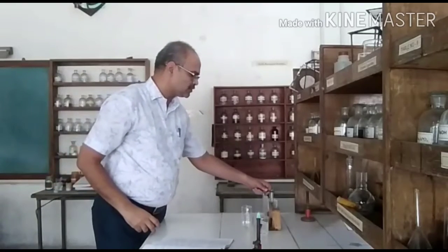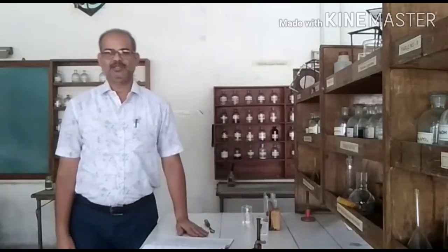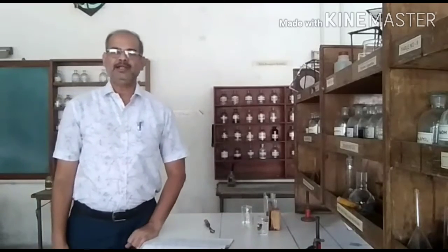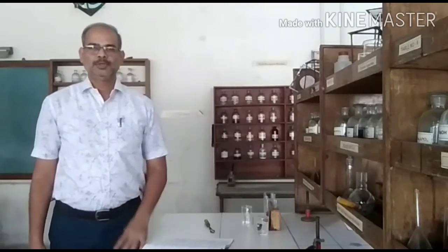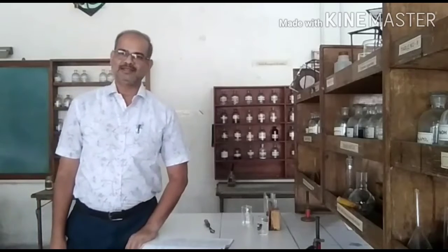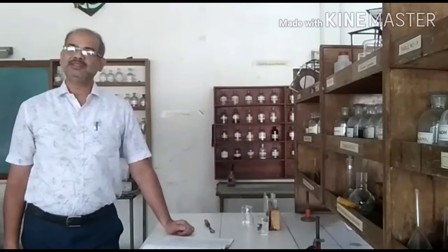So, with this Ct of SO4-2, when I took OS and added lead acetate to it, I got a white precipitate. I divided this white precipitate into two parts, in two different test tubes. In the first test tube, I added dilute HNO3. I found that the white PPT was insoluble in it. In the second test tube, I added hot ammonium acetate. I found that the white PPT dissolved in hot ammonium acetate. So all the conditions that are given in the observations are positive. As a result, SO4-2 is confirmed.